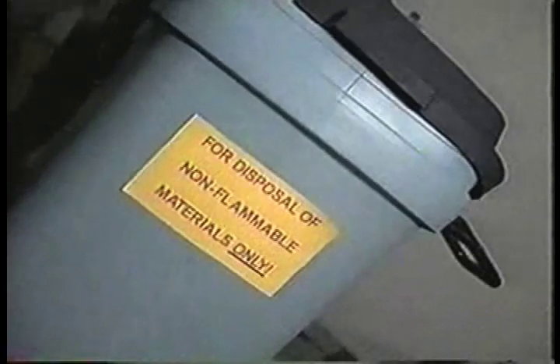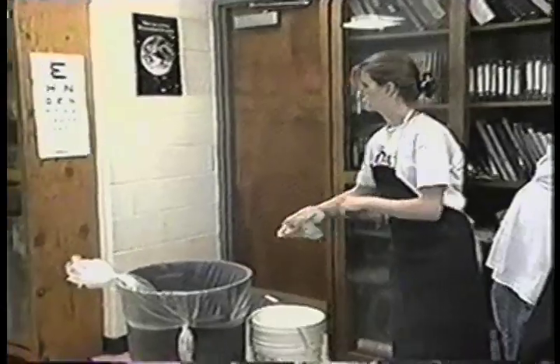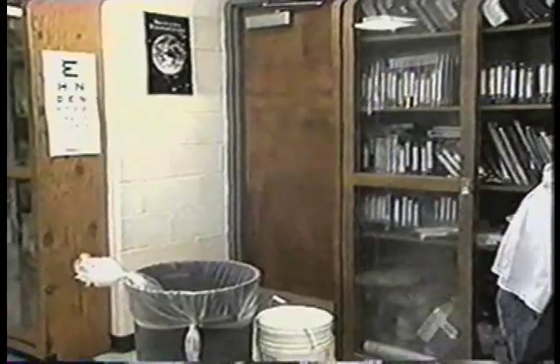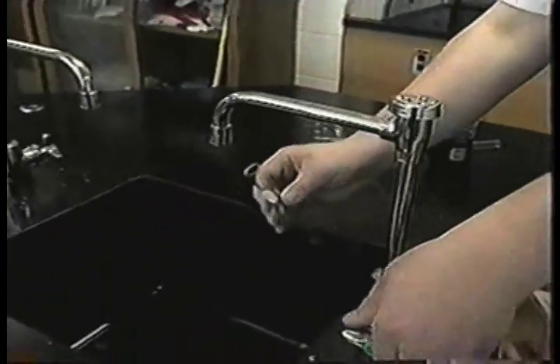Certain chemicals need to be disposed of in a certain way. Even paper towels used to clean certain chemicals must be separated from other paper wastes. And, as already mentioned, something as simple as pouring a chemical down the drain could lead to more trouble. And even if the slip-up seems minor, report it.